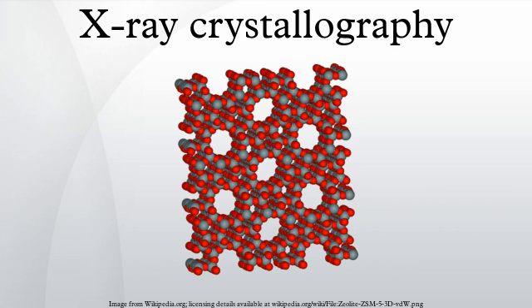Data processing begins with indexing the reflections. This means identifying the dimensions of the unit cell and which image peak corresponds to which position in reciprocal space. A byproduct of indexing is to determine the symmetry of the crystal, that is, its space group. Some space groups can be eliminated from the beginning. For example, reflection symmetries cannot be observed in chiral molecules. Thus, only 65 space groups of 230 possible are allowed for protein molecules, which are almost always chiral. Indexing is generally accomplished using an auto-indexing routine.